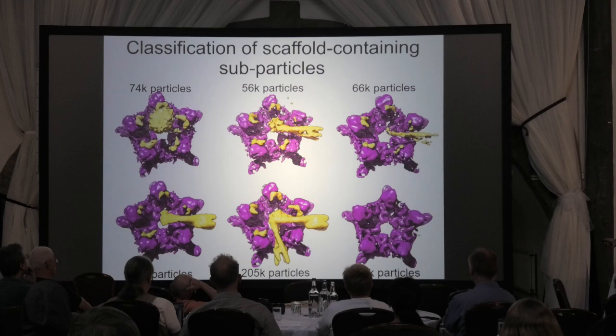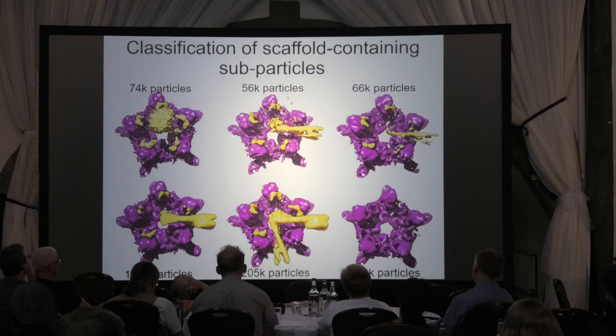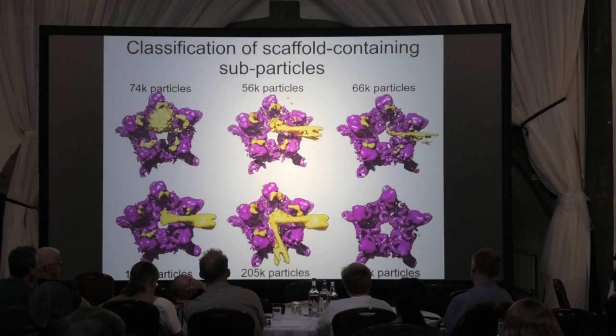And sure enough, we don't see any five-arm structures. The largest we see is a tetramer here. And this one matches quite well the PDB, the crystal structure of the scaffolding protein. We see more often just a single dimer. And then we see some sort of blobs. And you might notice these here.